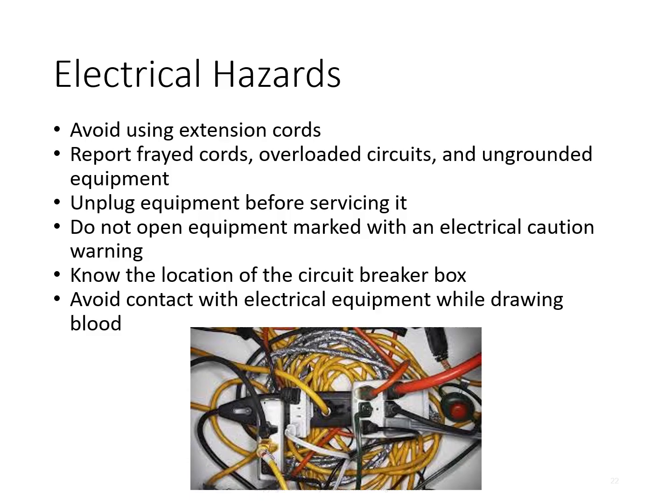Electrical hazards. Electrical hazards in the laboratory may result in shock or fire. So we want to avoid using extension cords. We want to report any frayed cords, any overloaded circuits, and ungrounded equipment. We also want to make sure we unplug equipment before servicing it. We do not open equipment marked with an electrical caution warning, and we know the location of the circuit breaker box just in case we do need to cut electricity. And also make sure to avoid contact with electrical equipment while drawing blood.